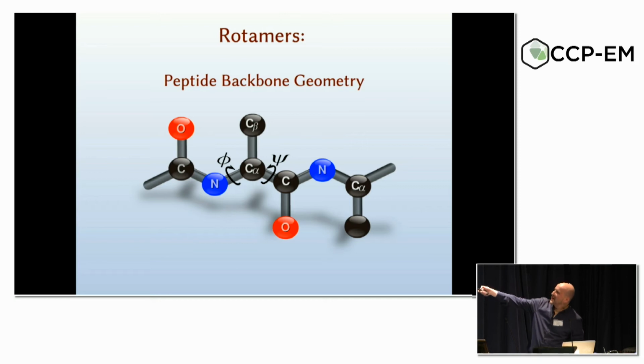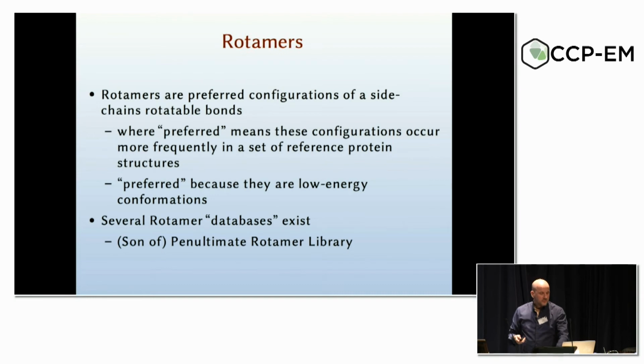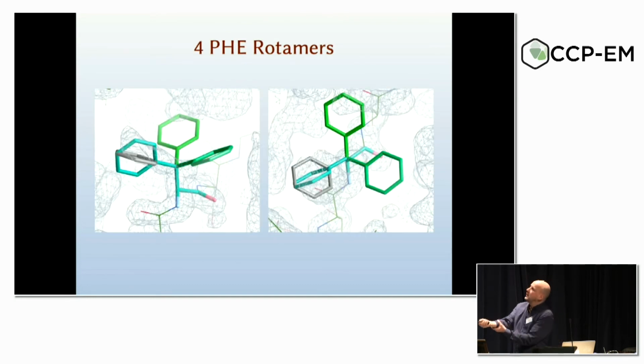Okay, so Coot is cutting the bonds at C and N and C and N, and only these atoms are being modified by the algorithm. At least that's how it used to be. And moving on, what we're going to do is take a set of high probability chi-angles.